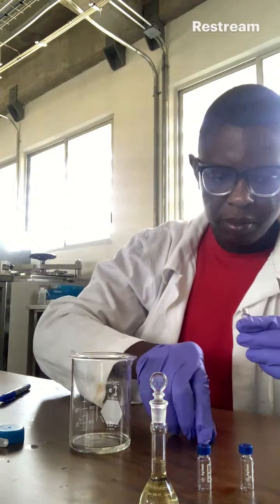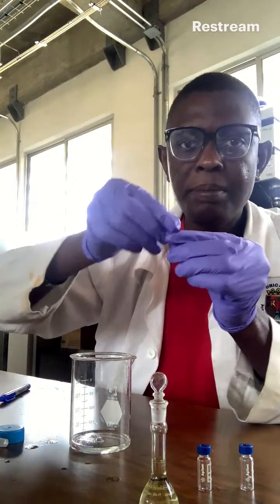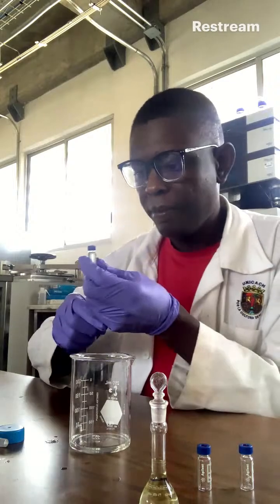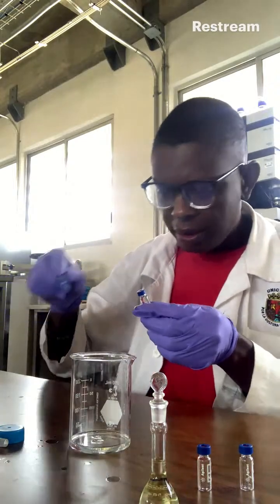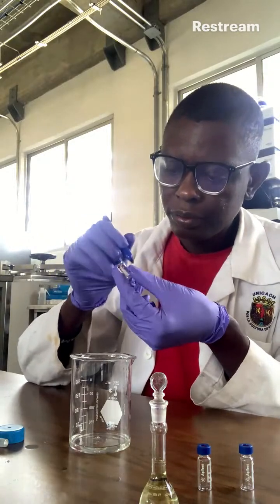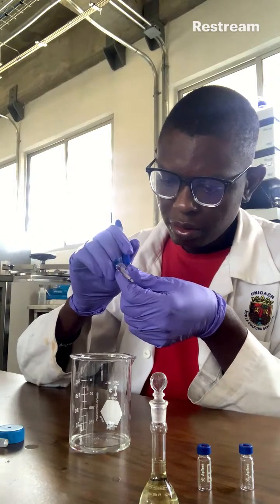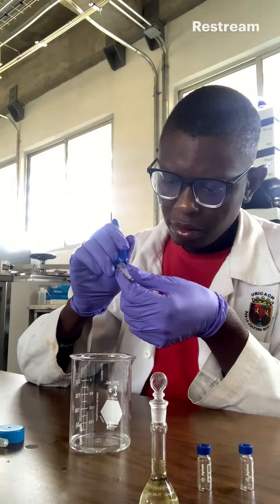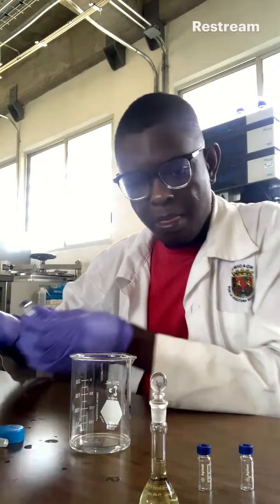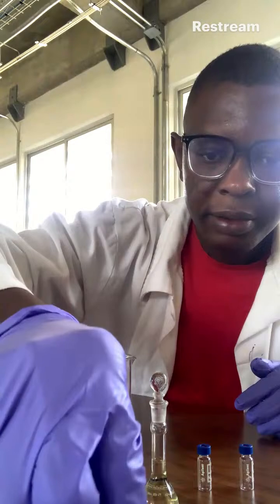I'll also label the sample GC banana. So I've gotten my sample GC banana.